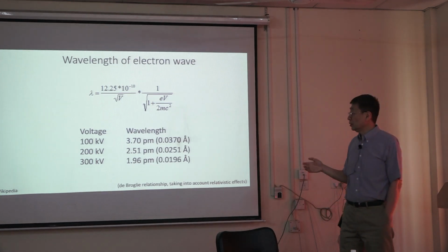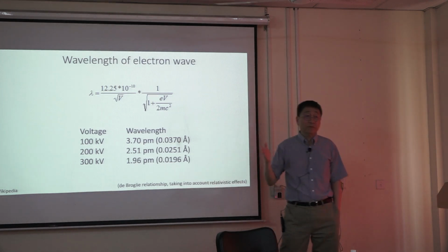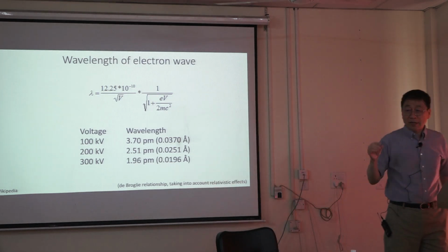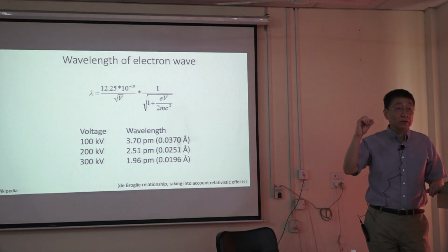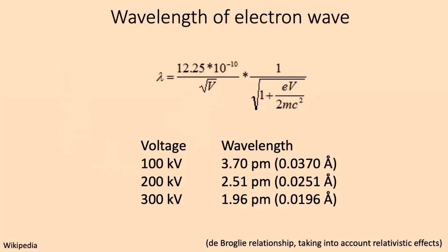Okay, so certainly you can see very detailed information, but then electrons are very light, so there are limitations on how thick a sample you can go. X-rays are penetrating, they go through almost anything. Electrons are very light, so you have to have very thin samples. Anything that gets thicker, you see black. The electron cannot go through, you don't see it. So that's one of the limitations.